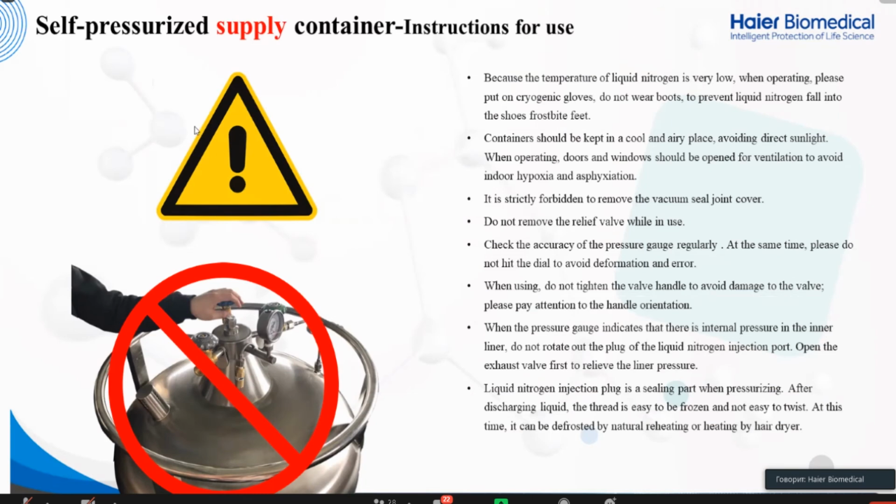This is the self-pressure supply container's instructions for use, and I will transfer to you the forbidden ways when we do the technical training. There are actually a lot of operation directions and attentions needed. We need to be careful on that.